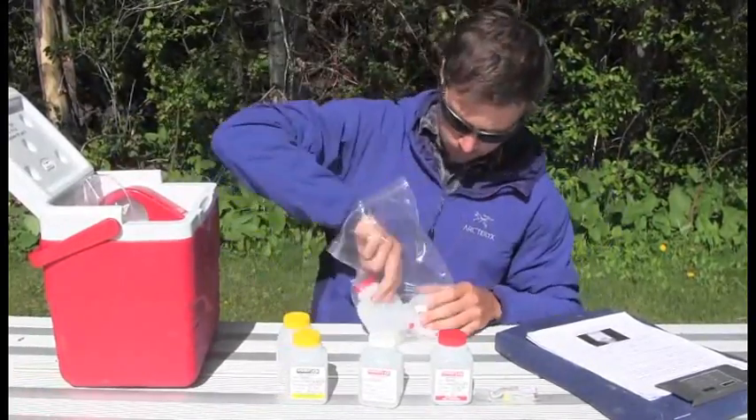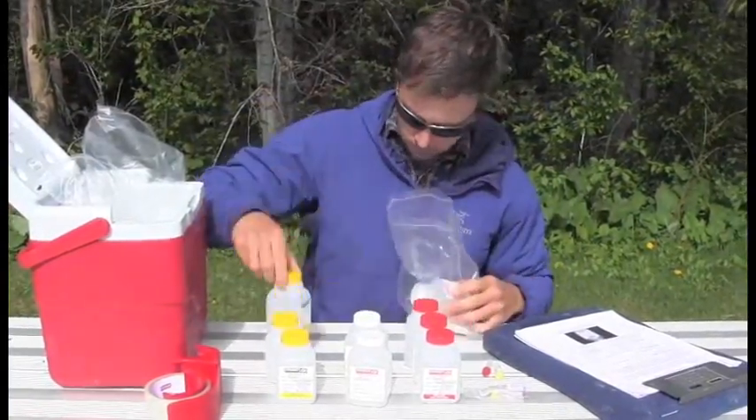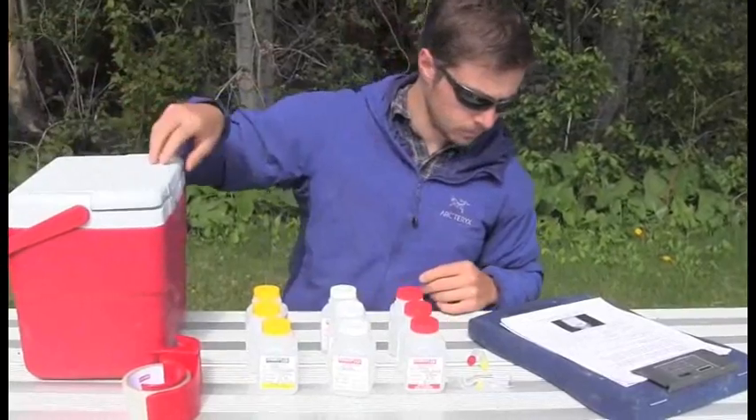In total, we will be filling 9 bottles for this site: 3 for our sample, 3 for our duplicates, and 3 for our blanks.